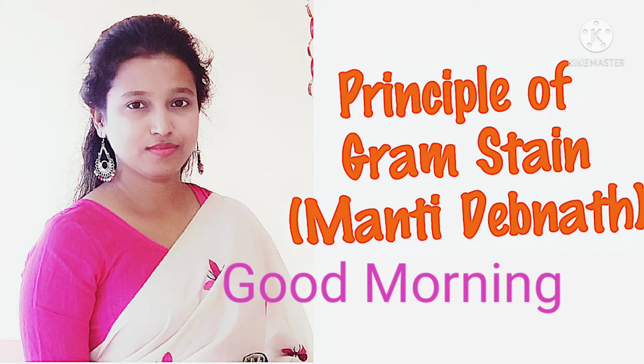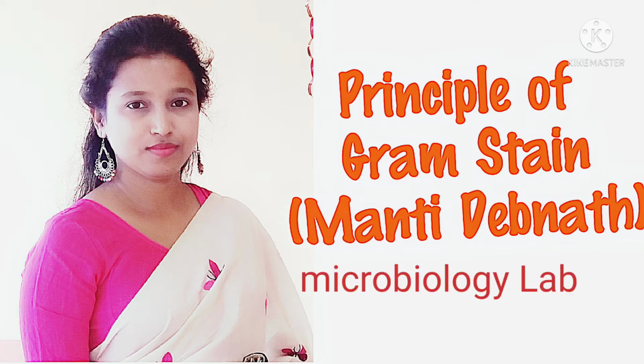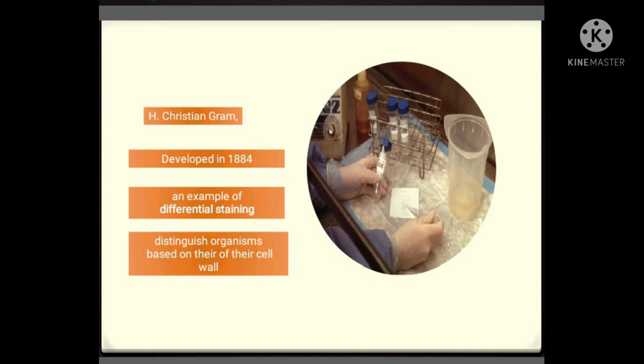Good morning. Today's topic is gram stain. Gram stain is an important differential staining procedure which is used in our regular microbiology lab. On the basis of the reaction in the gram stain, bacteria can be divided into two major groups. One is gram positive and another one is gram negative.